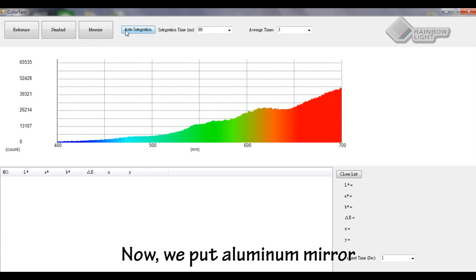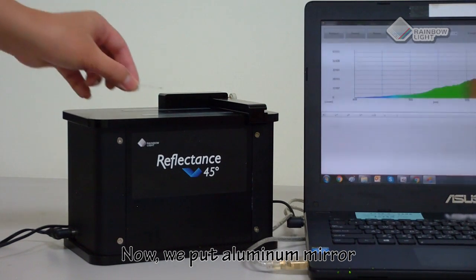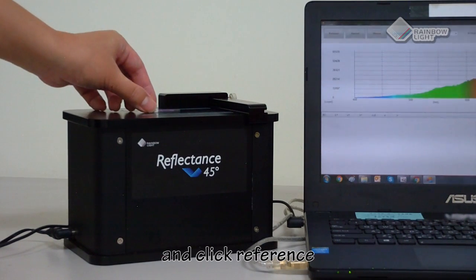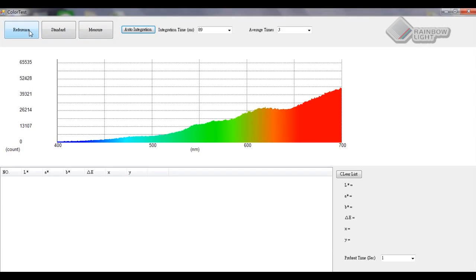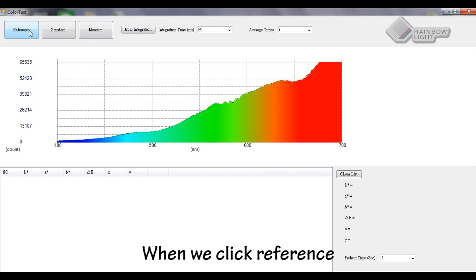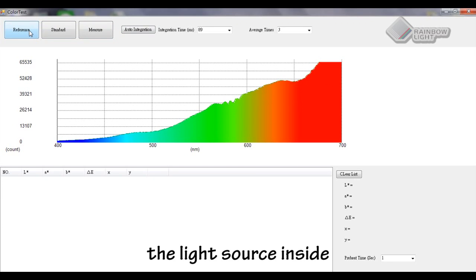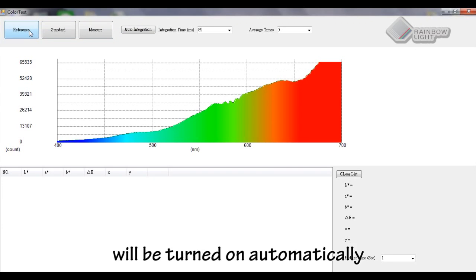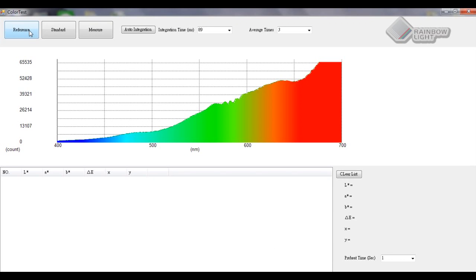Now we can put the aluminum mirror and click reference. When we click reference, the light source inside will be turned on automatically.